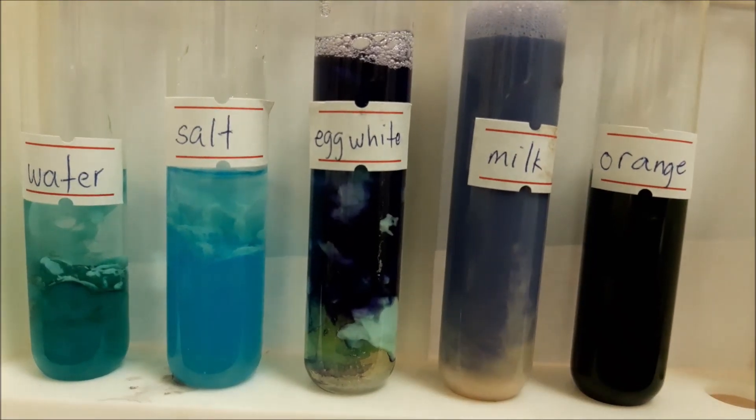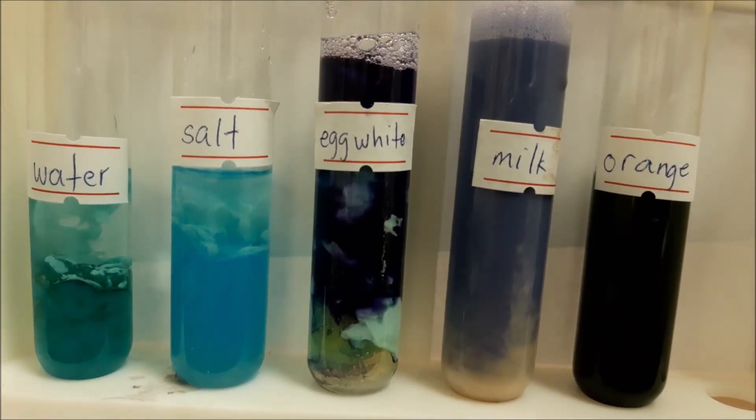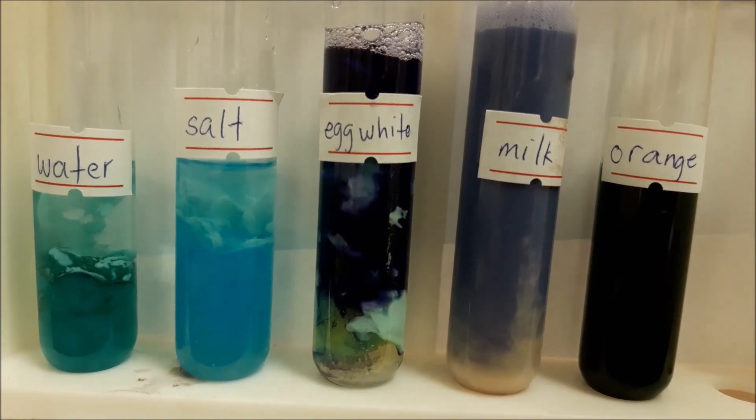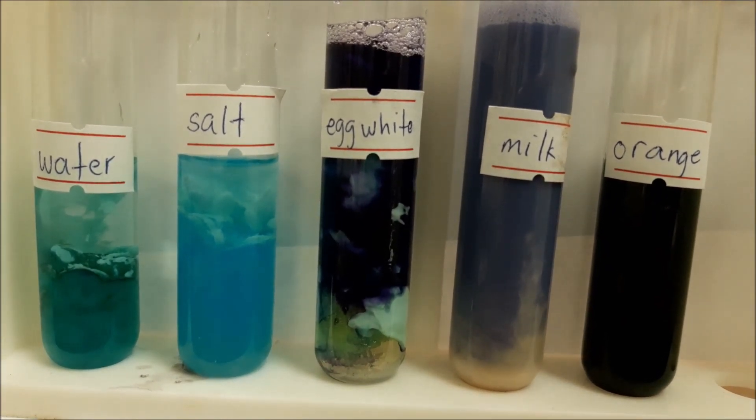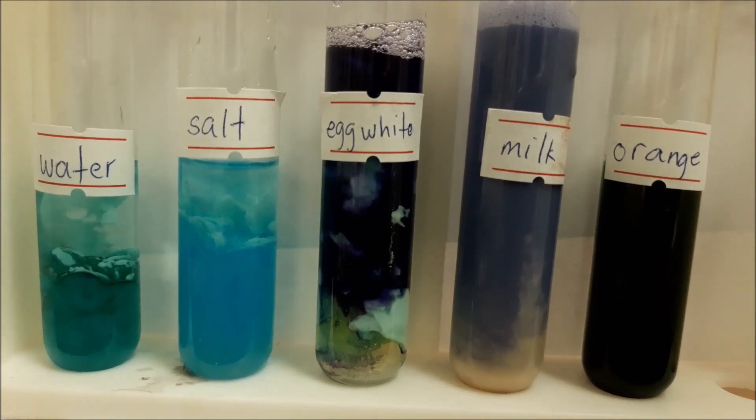To determine which food item has protein on it, we will look at the color. If it turns purple, that are the food items that have protein.